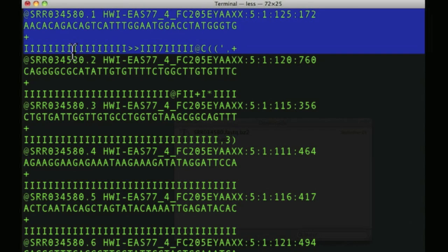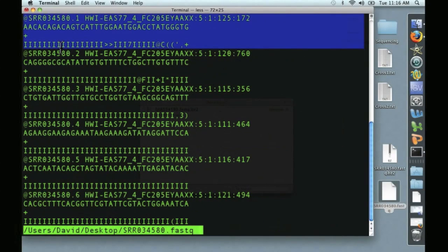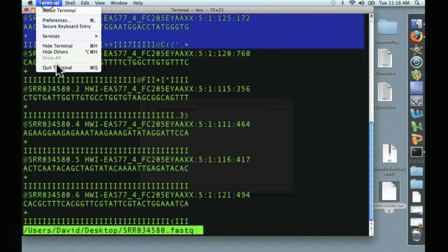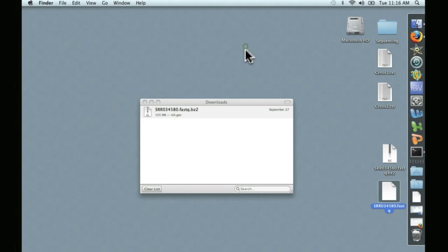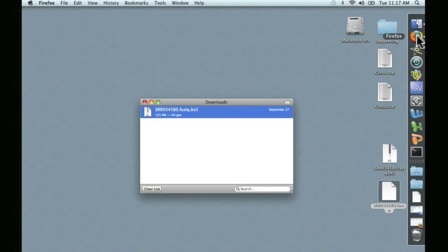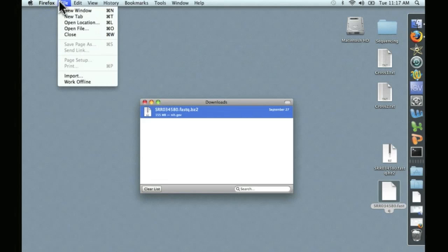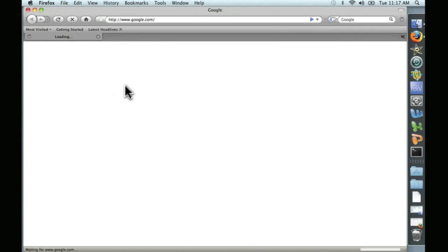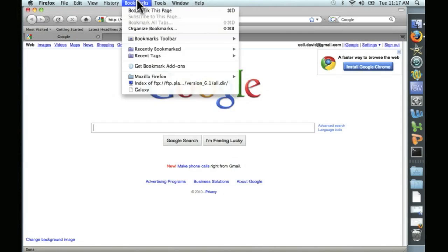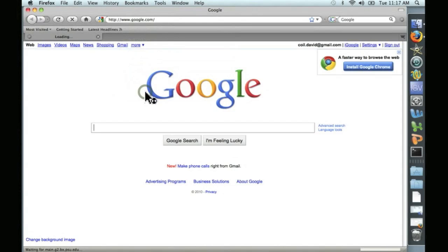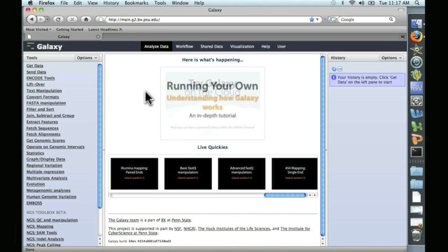Let's go ahead and put this into Galaxy. Let's get out of the terminal. Open up a browser. And I've gone ahead and bookmarked Galaxy so you can easily find it. And here we are at Galaxy again.